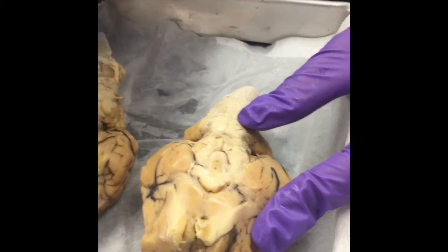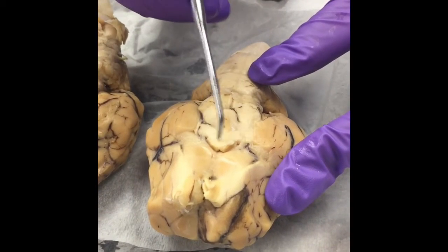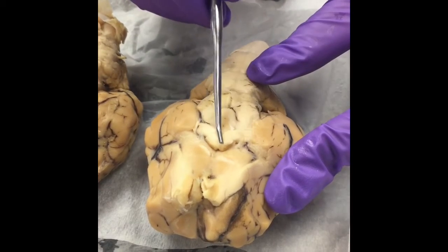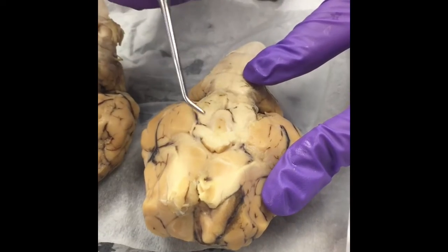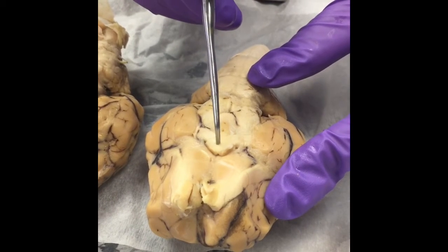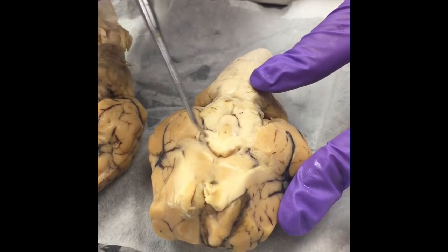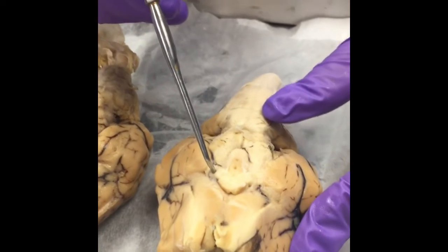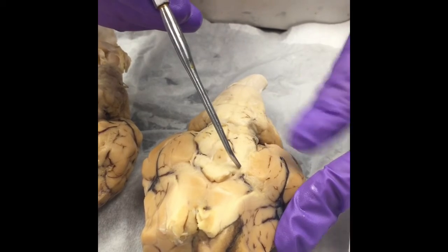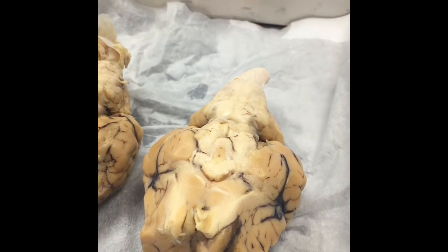See this section right in the center here? It protrudes out a little. It would normally look like an X, where coming from this point, you would have a nerve extending out this way and another extending out this way, one to each eye. That's the optic nerve, which is cranial nerve number 2. Where they meet in the middle is called the optic chiasma, and then where you follow them back into the brain is called the optic tract. Okay. That's what brings the impulses from the optic nerve to the occipital lobes of the brain. The optic tracts travel all the way back.